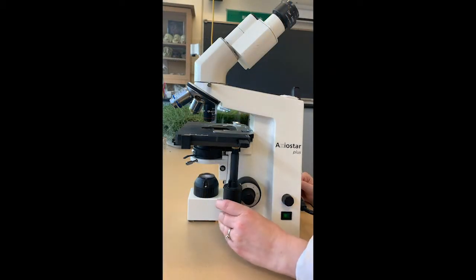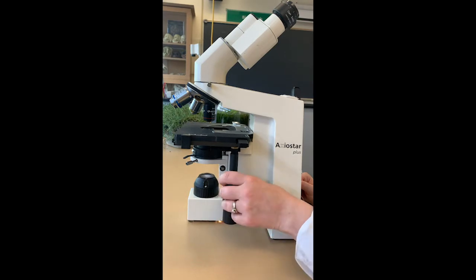We have the XY adjustment knobs that adjust the stage.